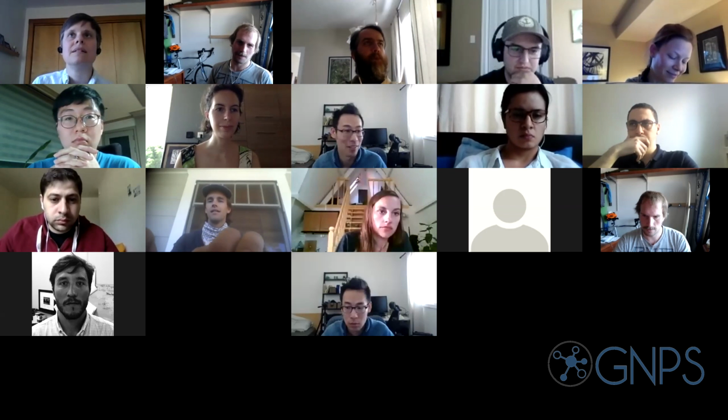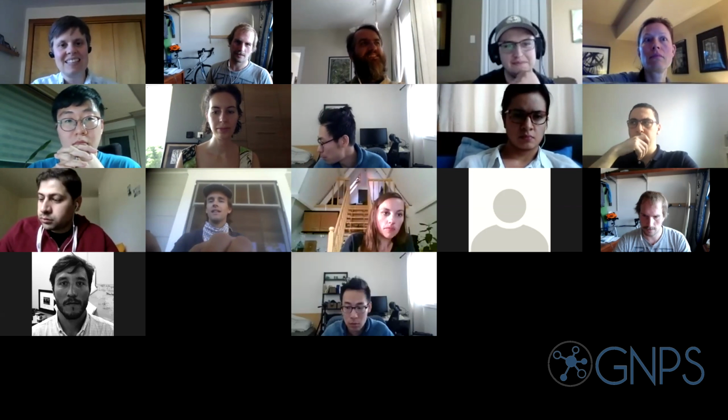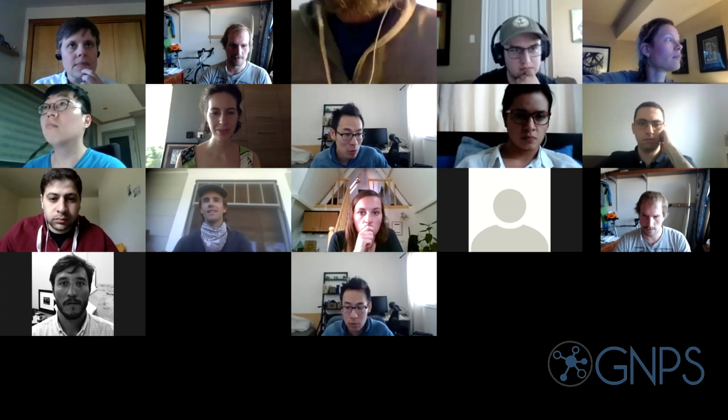So is that already available in GNPS or is that coming? Yeah, it's available now, actually. If you go to the tool index, because we built this since I can't find anything on GNPS, I don't know how other people do it. Let me link that really quick. It's still a work in progress, as you can see, there's a bunch of to-dos because there are so many things we need to put in there. But under the tools, there is a merge polarity networks tool. So there are link outs to that.